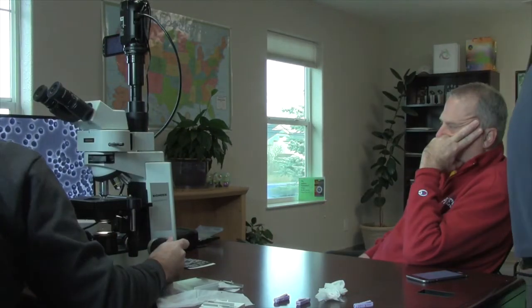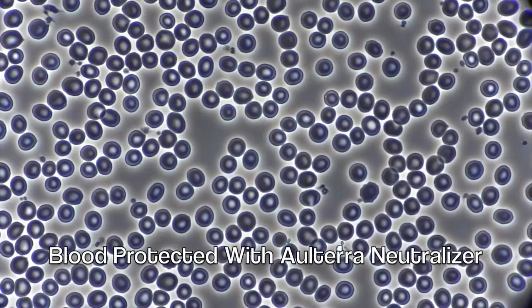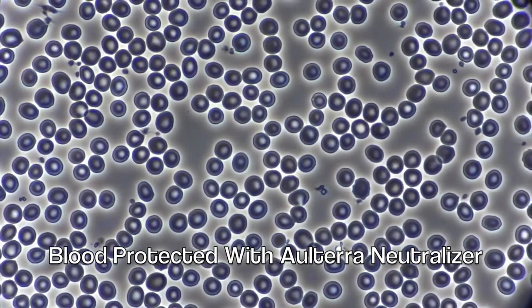Okay, so this is a couple minutes after talking on the phone with the neutralizer — that's beautiful, that's a great shot. And that's good-looking blood, it's like perfect.